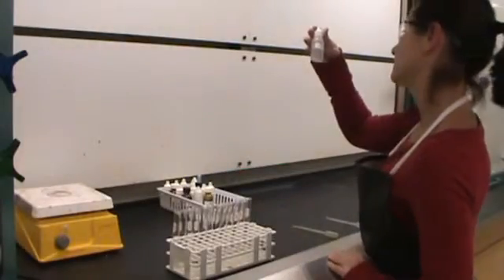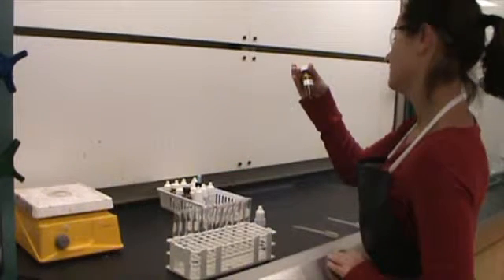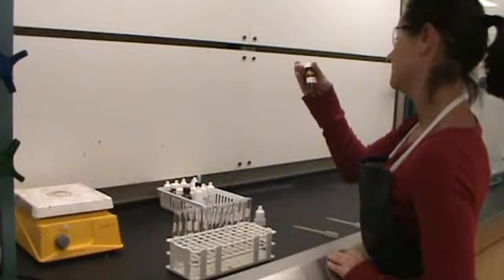In Part 3, you will be mixing deionized water with different alcohols that increase by 1 carbon each. Make sure that you read the labels carefully. Organic chemicals have very similar names and may only differ by 1 number, so be extra careful that you have picked up the correct chemical.